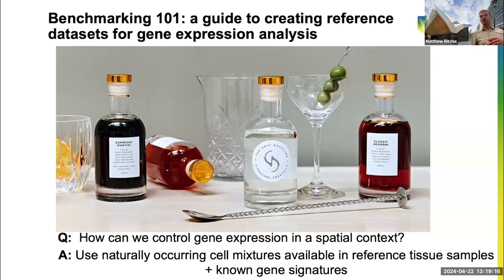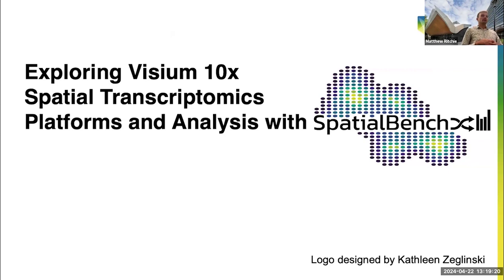We'll be using some reference tissues that are coming from a real biological entity. So the first part of the talk is about a project we call SpatialBench. And this is focused on 10x Visium spatial transcriptomic technology.